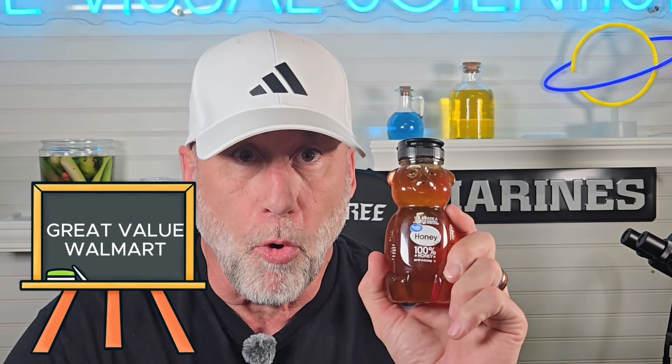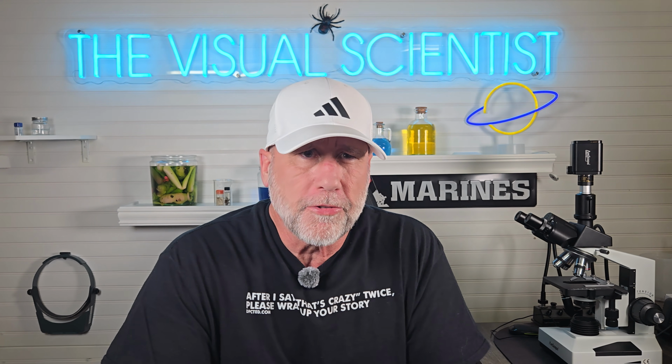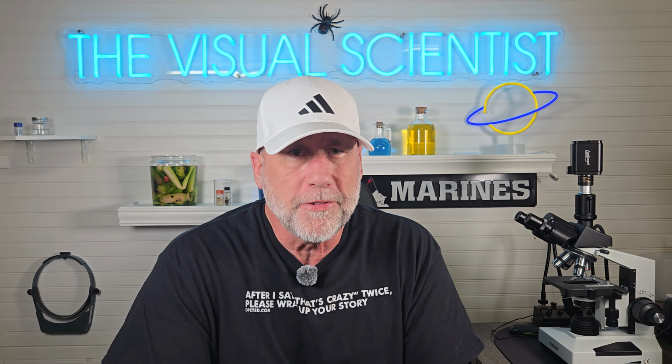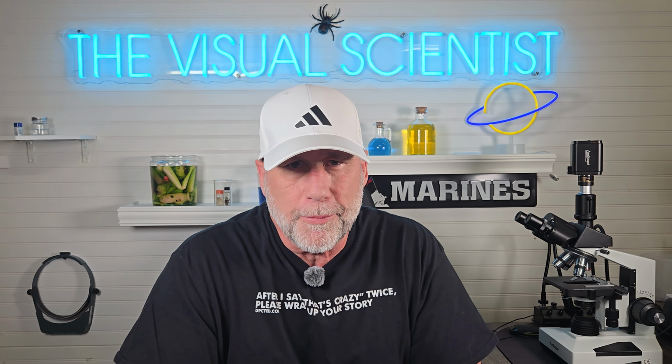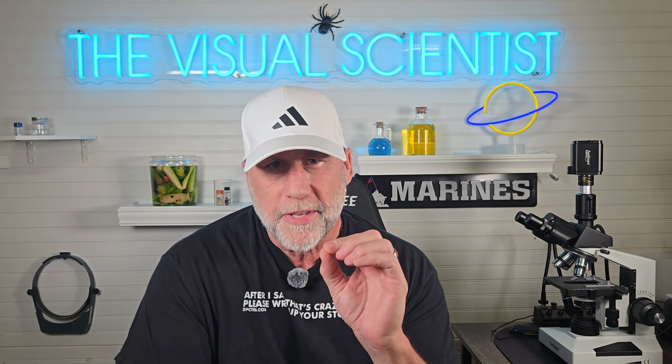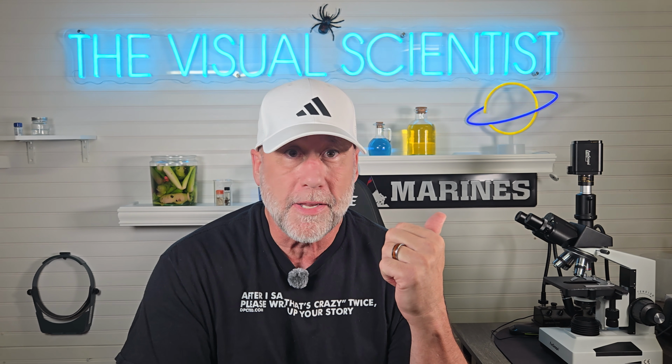Evidence A, Great Value 100% Pure Honey, Walmart store brand. Grade D. Ultra-filtered, no pollen under the scope, uniform geometric crystallization, exactly what I described as a red flag. Remarkably clean at 1,000 times. It carries a legal name, but the microscope says the biology was processed out of it. It's honey's ID card on a completely different product.